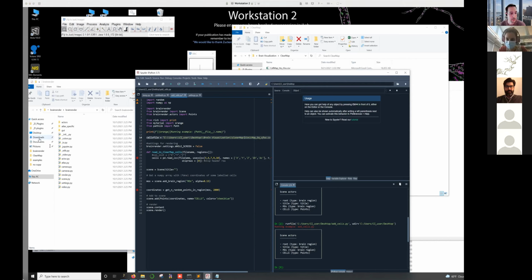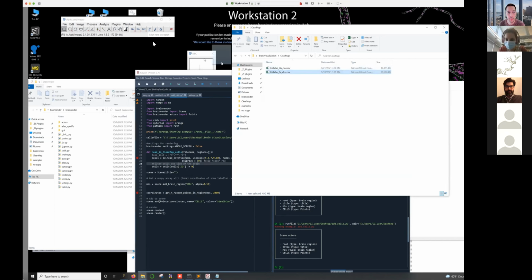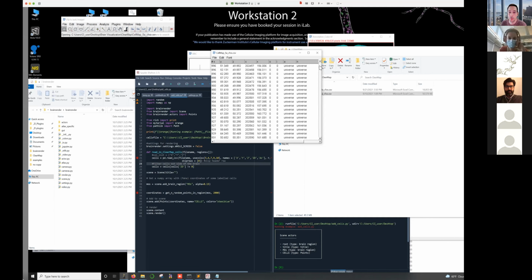Okay, and then the next part in our function that we're working on here, we need to filter the cells. You can actually see BrainJ doesn't really have this issue. Any cell that's outside of the brain is immediately filtered out. But you'll find that in these data sets, I'm just going to open this up again, you'll probably have a bunch of cells that have plotted out into the universe. So this could be debris or some false positives that were outside the brain or outside the tissue, or maybe on the edge of the brain that got mapped outside of the brain. Anything like that, we don't really want to plot.